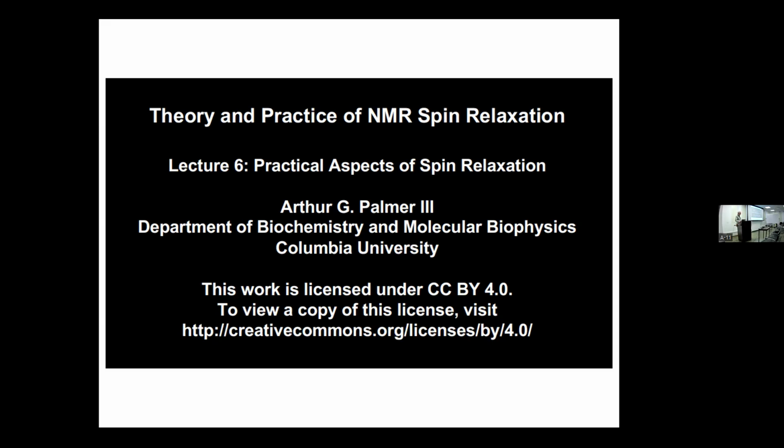But if you can afford to have some methyls around that are protonated, those are useful in shortening the recycle delays, because normally at the start of acquisition, you will have saturated all the proton magnetization. The last thing you do is have some proton 90, so that any Z magnetization ends up in the transverse plane and is usually dephased by some gradient if it's not to be reported.